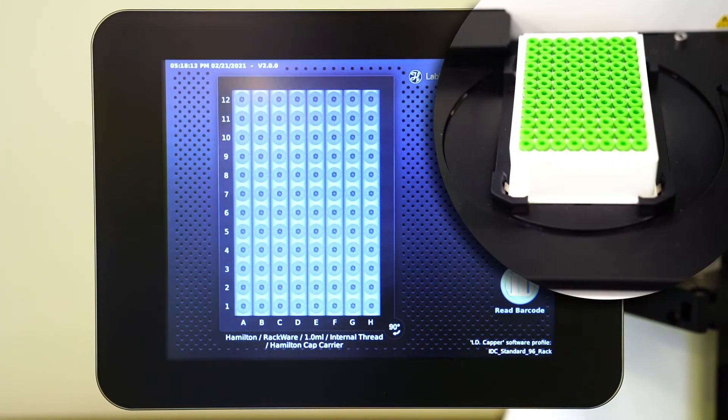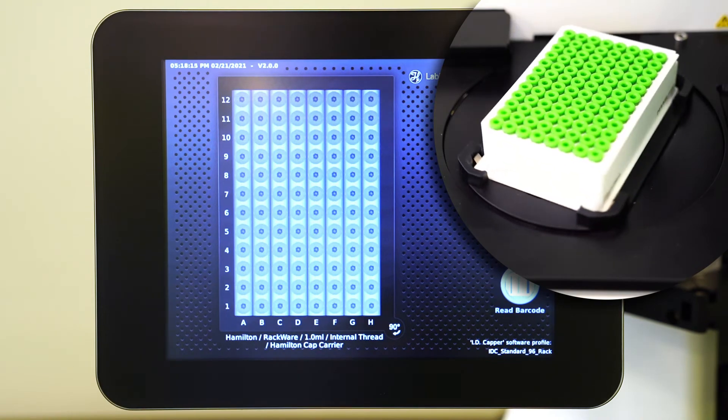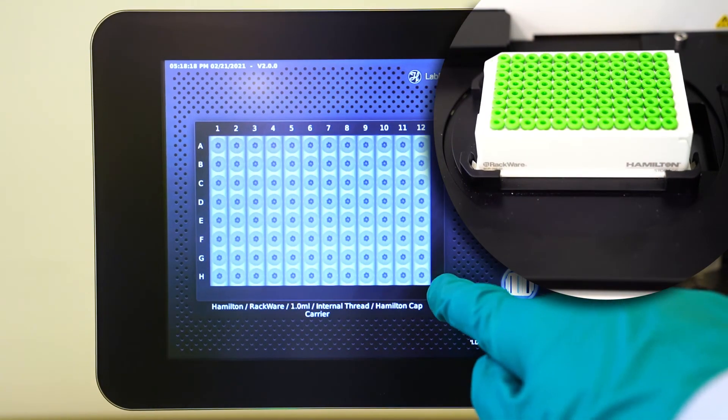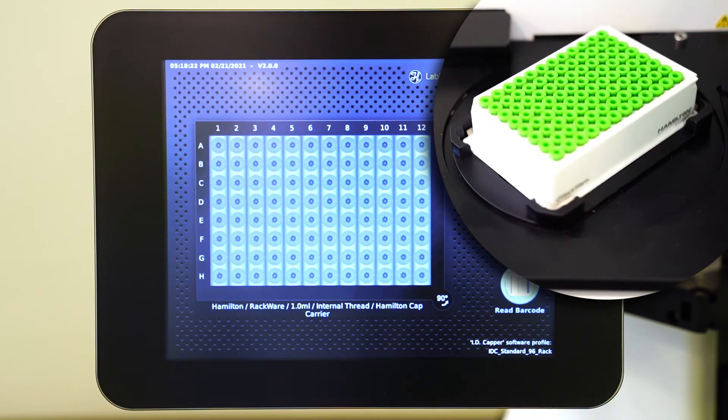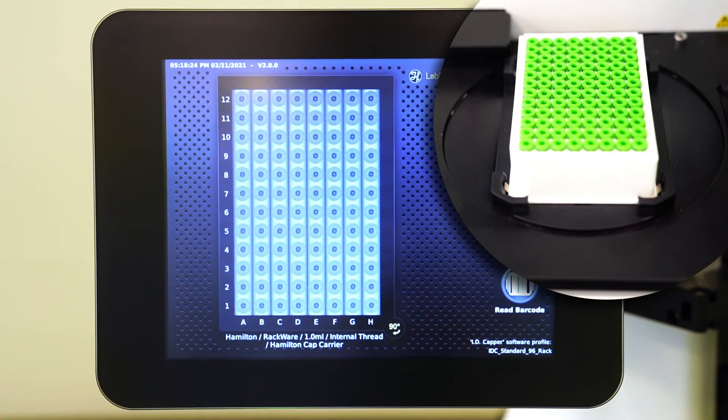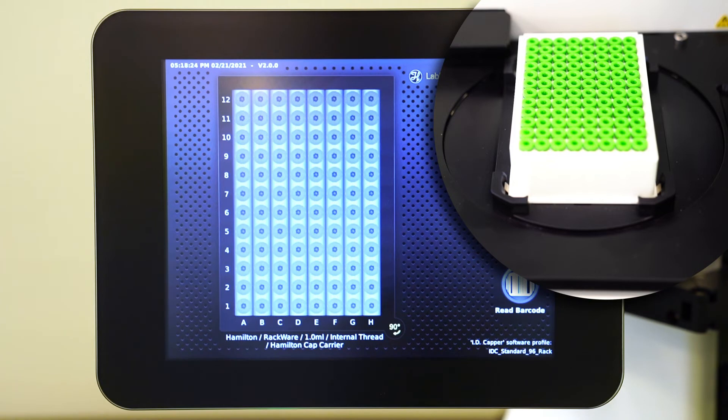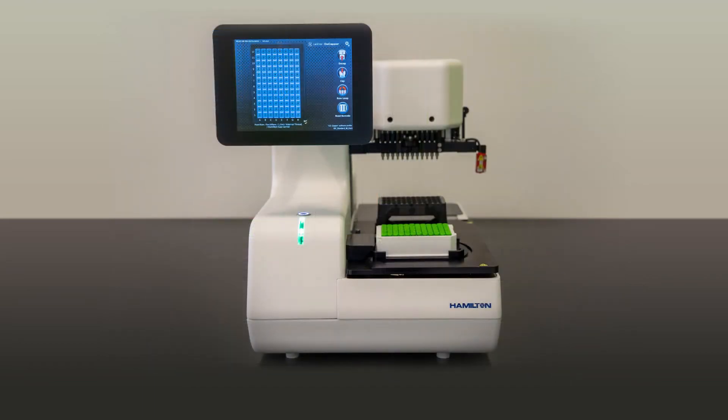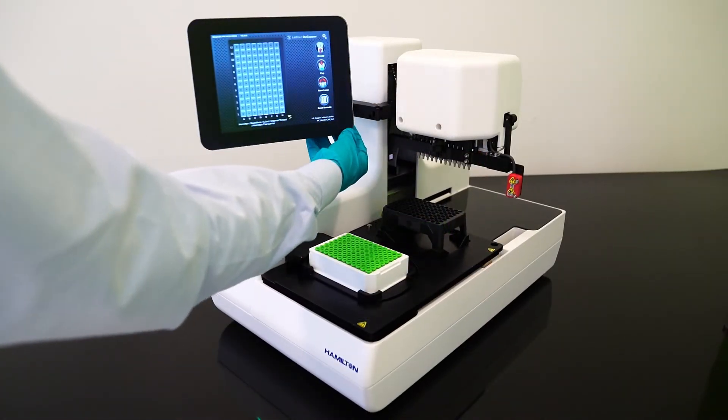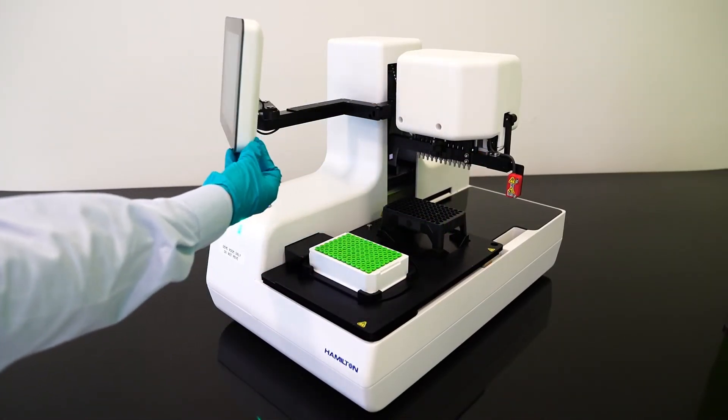The Decapper extends its superior flexibility with two additional features which allow seamless integration with other automation. First is the turntable feature to process tubes in either portrait or landscape mode, allowing for the use of a handoff device. As you can see here, at the bottom of the touch screen there is a 90 degree button. Selecting this button will adjust the turntable so the rack can be capped in portrait mode. Second, you have the option to change the orientation of the entire machine by placing the instrument on the bench top in a sideways fashion or front to back. The swivel mounted touch screen and settings in the software allow either configuration.